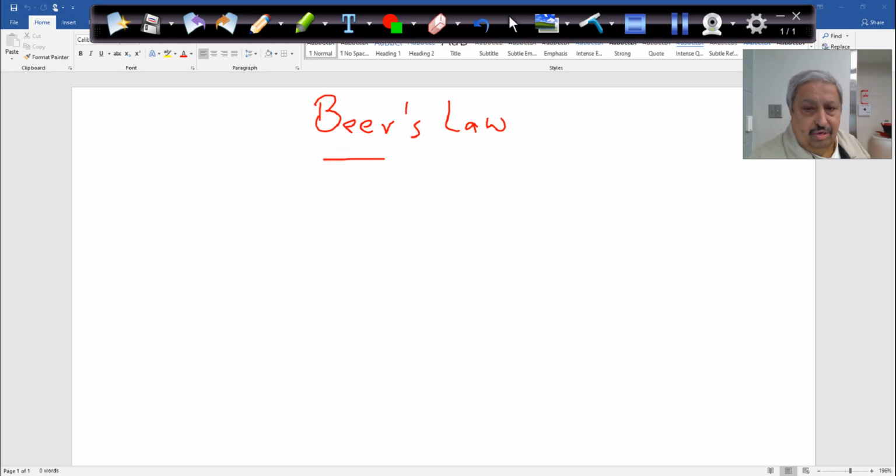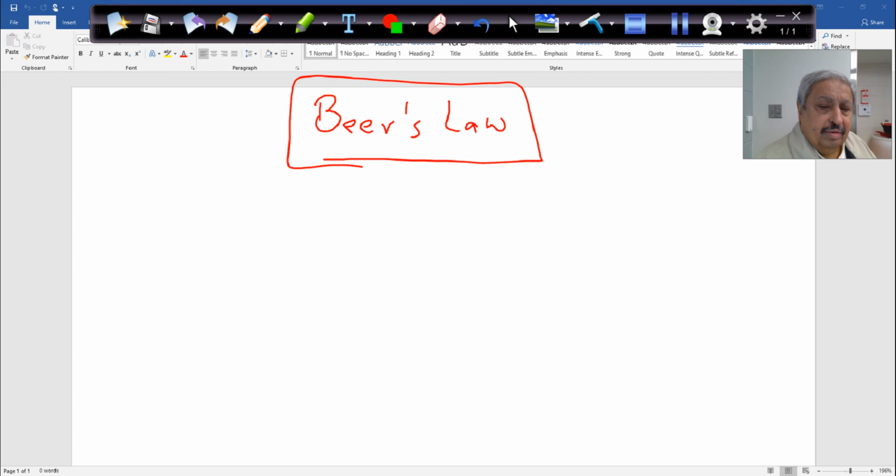So Beer's law is about a color solution.